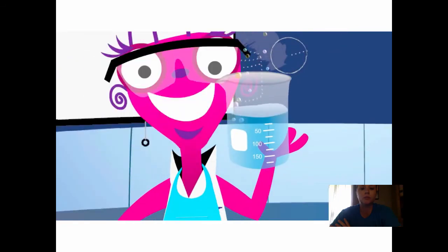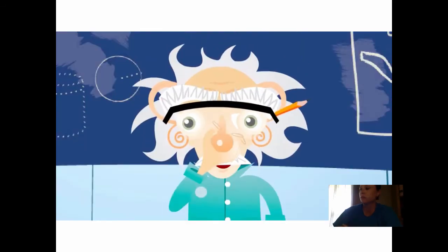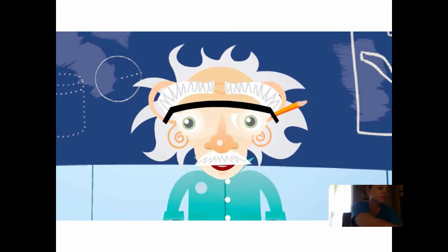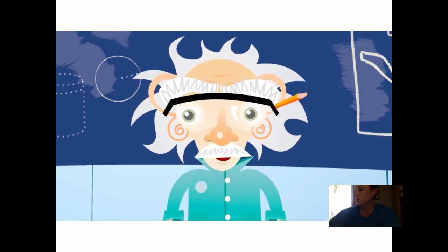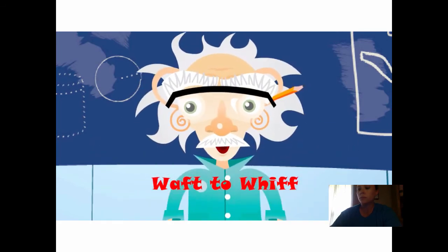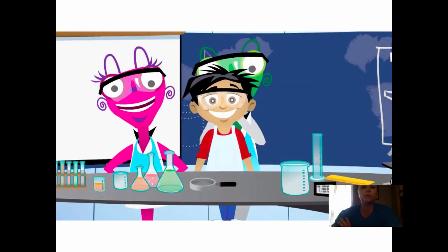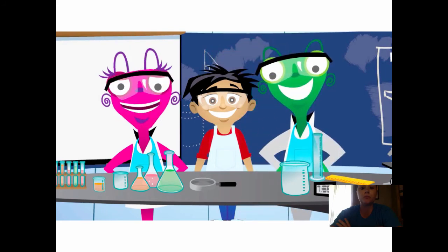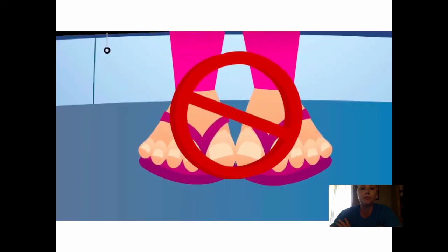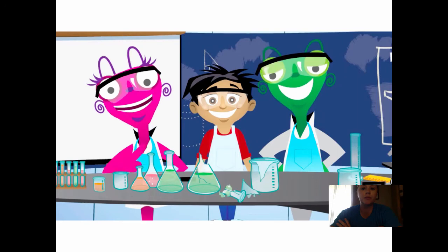You'll be sorry. Oh yeah, you'll be sorry. The moral of the story, listen to your teacher and what to live. Push up long sleeves, tie back long hair, and don't wear open-toed shoes. That's nice. Never mix chemicals unless you're told exactly what to do.